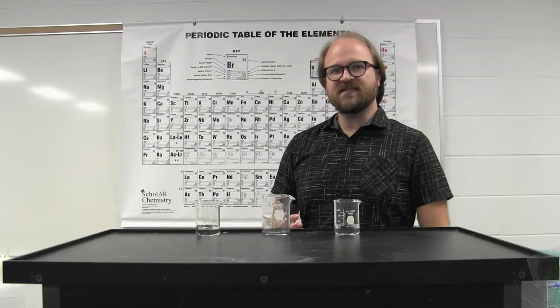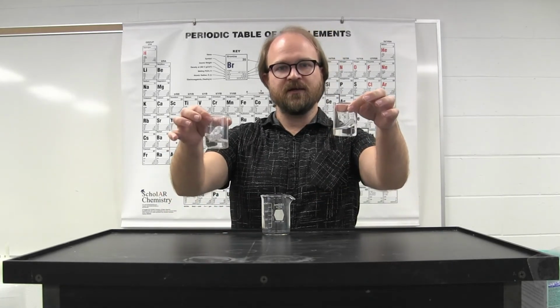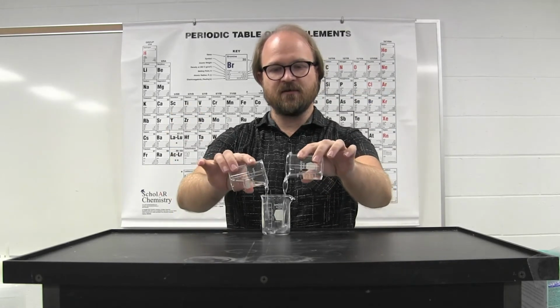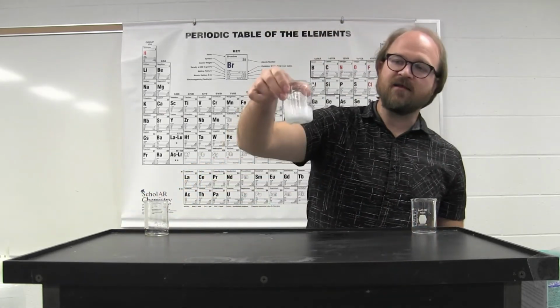In part B of the experiment, you're focusing on precipitation reactions. You have seen precipitation reactions in a number of the experiments before. A precipitation reaction is where you have 2 completely clear liquids, and when you mix them together, it forms a solid.